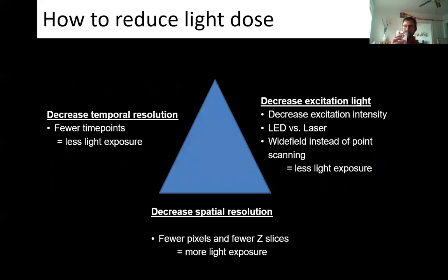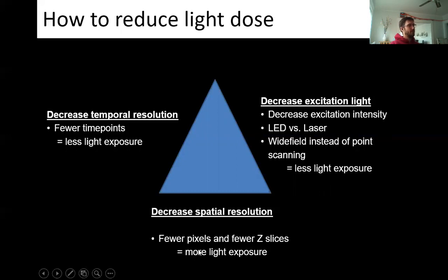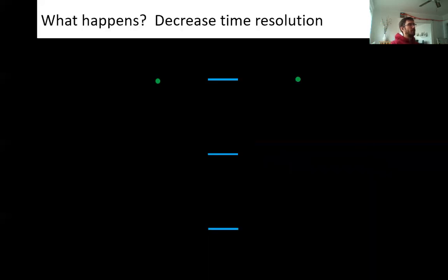There are three major ways to reduce light dose: decrease temporal resolution (take fewer time points), decrease excitation light by turning down laser or LED power or switching to widefield instead of point scanning, and decrease spatial resolution by scanning fewer pixels or fewer z-slices. Each of these comes with trade-offs.